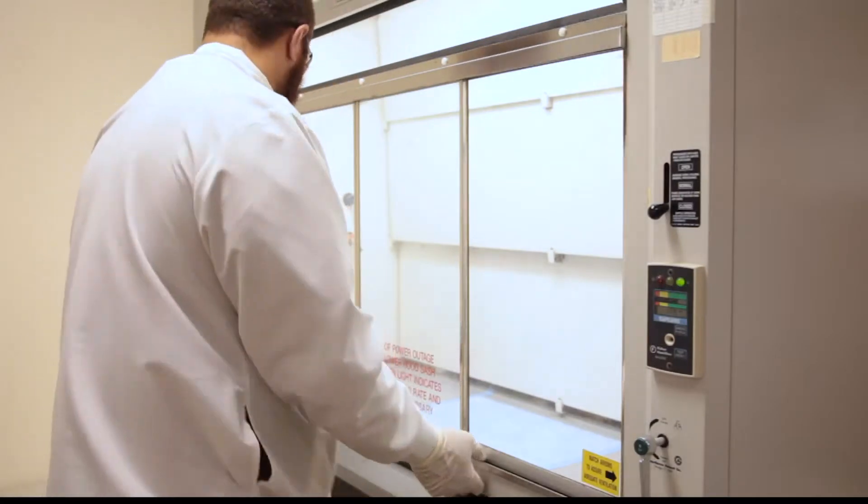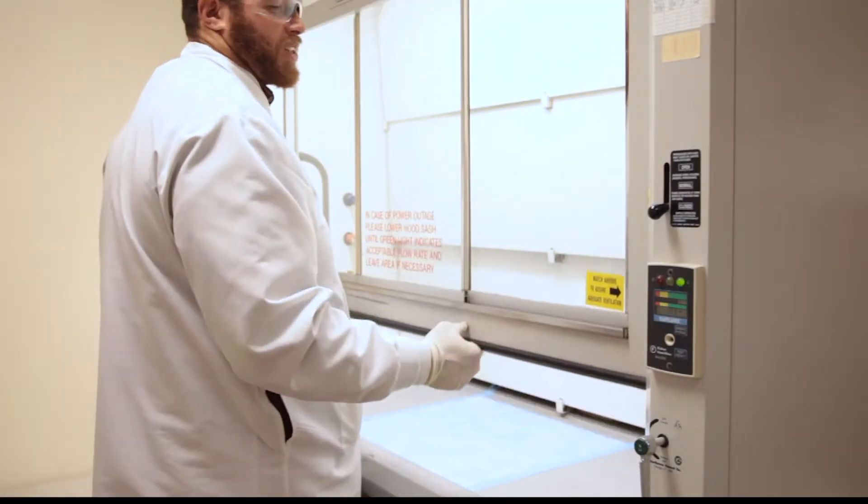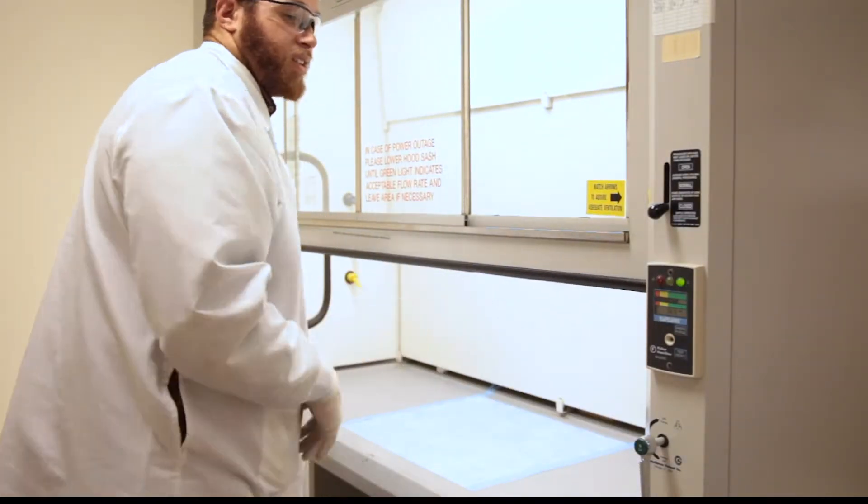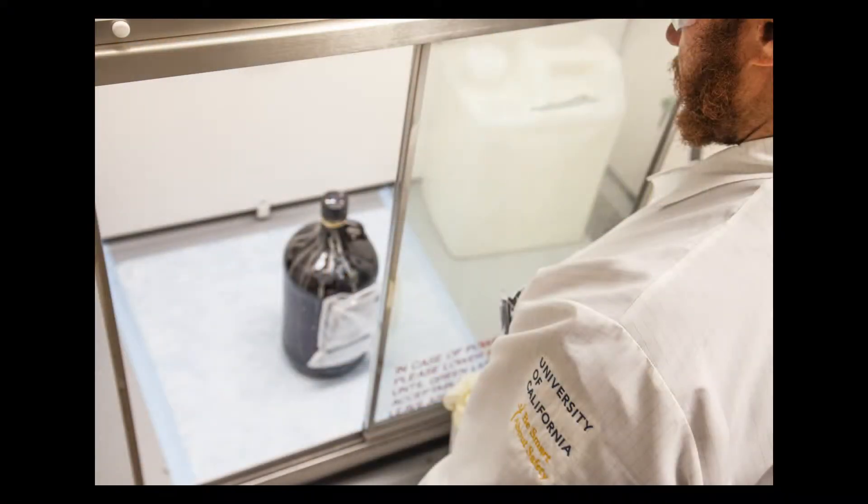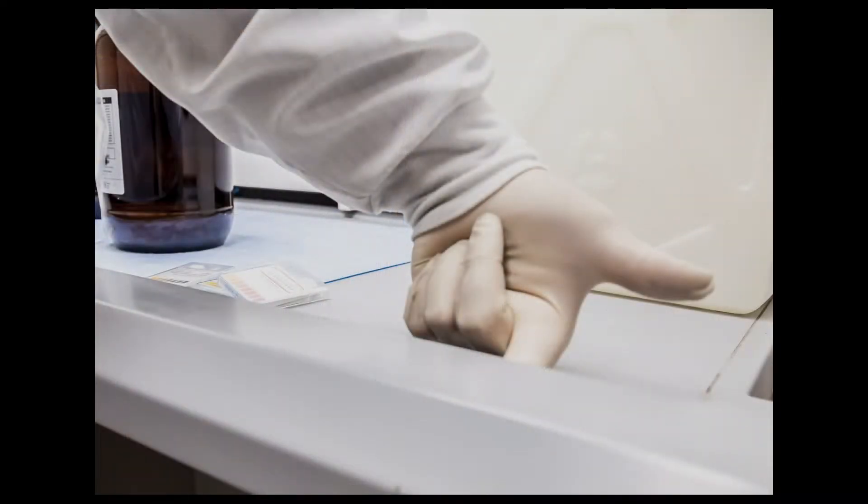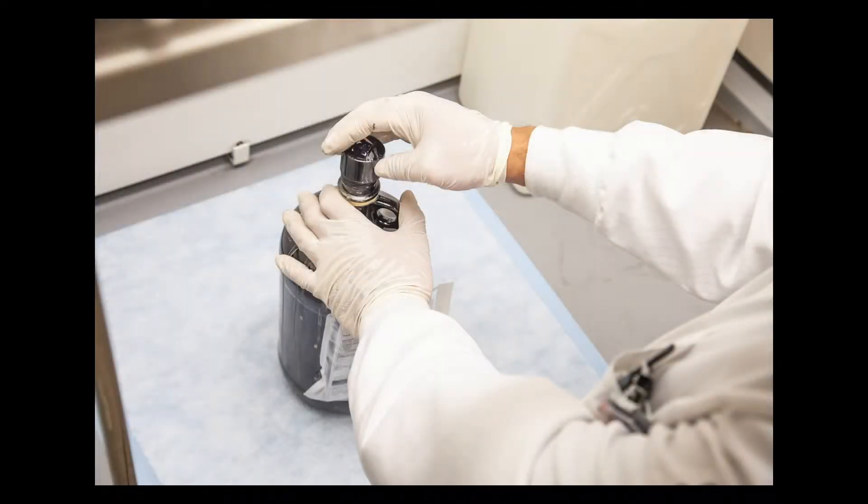An adjustable sash changes airflow across the hood to maximize capture of contaminants. The hood body is the visible part of the hood that contains the hazardous gases and vapors. The airfoil prevents turbulent air flows that can carry vapors out of the hood. And the work surface is where you perform your work.